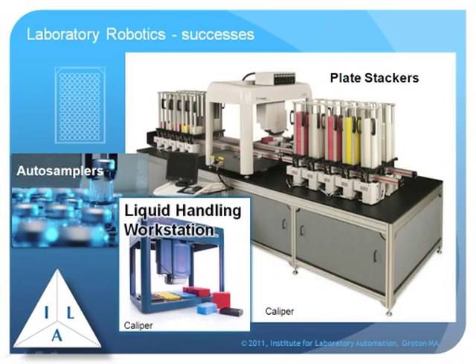The most notable example we have for laboratory robotics is the autosampler that we use to take vials, samples, and introduce them into chromatographs or other devices. But areas in life sciences have even more robust techniques for dealing with robotics.